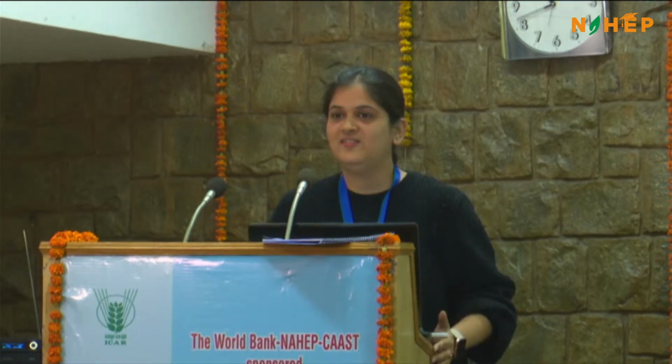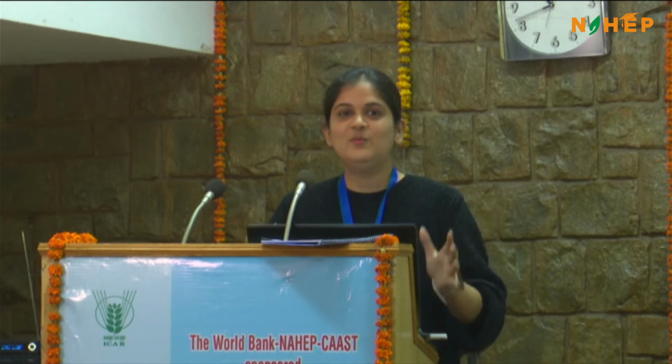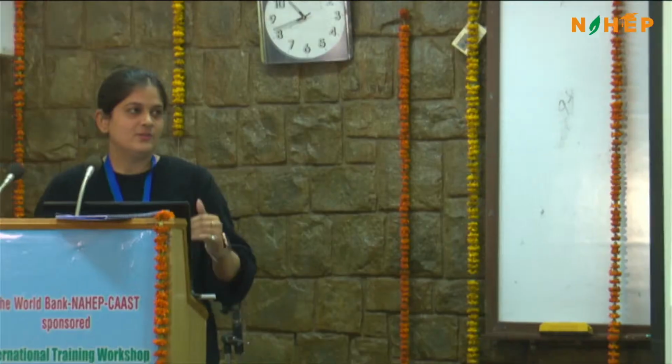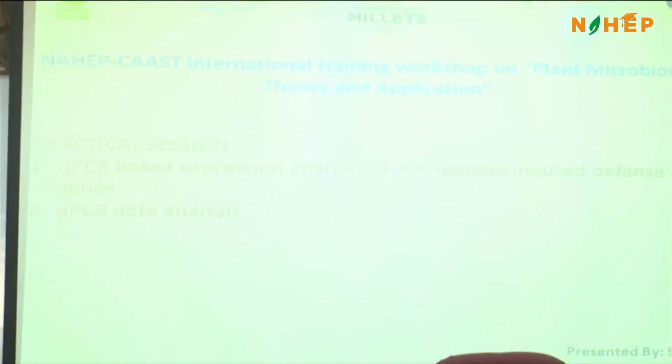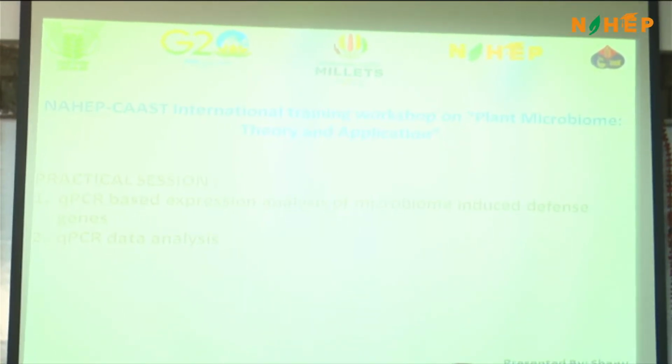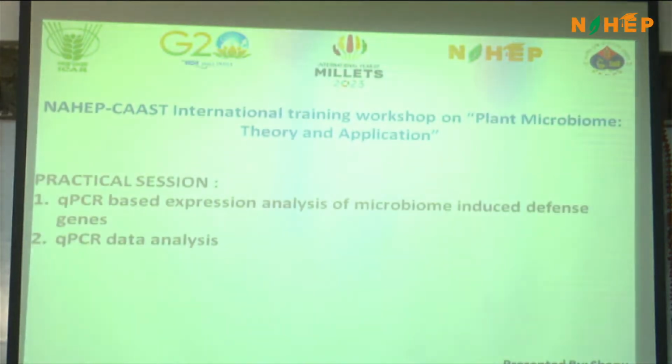Sir has explained every detail which we need for qPCR analysis and how to apply it. So I would just give a brief of something like that also. I'll be telling you what are the formulas which we need for the analysis part, how to convert the CQ value or the CT value, or some machines also give CP value, into the fold change. And then Javed sir will be telling you practically how to do it in the Excel. So I will start.